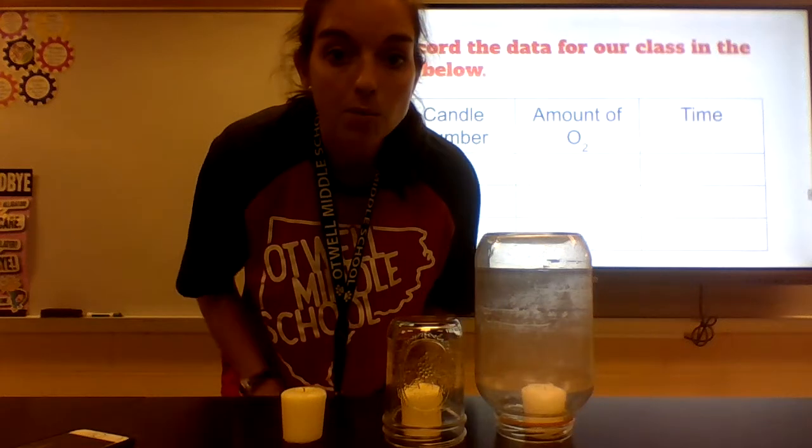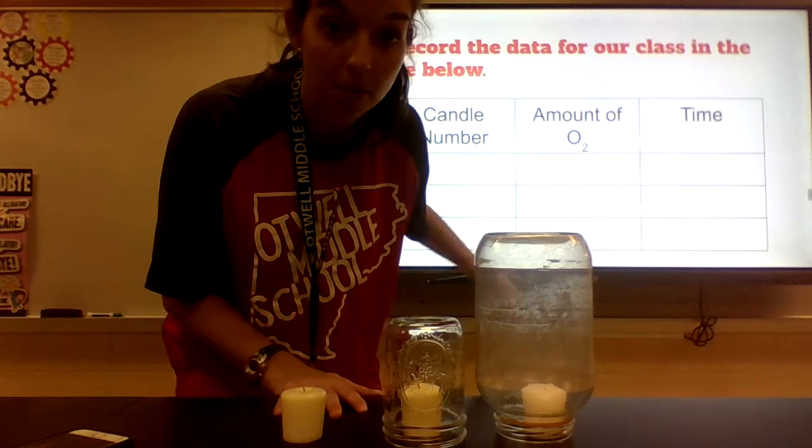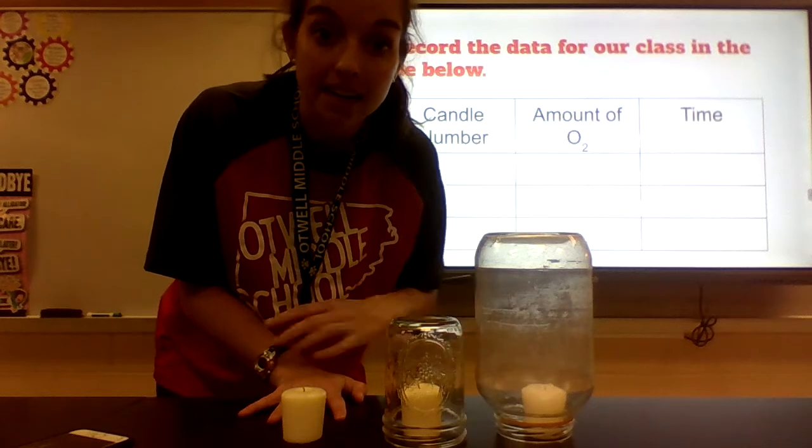All right, so I'm going to do the experiment here today. I'm also going to record the data on the screen up here. It's a little hard to see from this distance, so when I'm done with the experiment, I'll move the camera closer so you can copy the data in your own data chart.